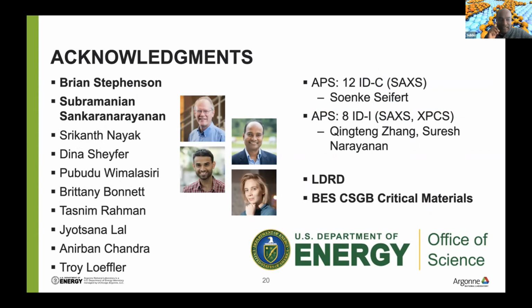So, Michael, I know you basically pointed to the modeling side where the AI/ML could actually be useful, but in terms of directly extracting information from the XPCS experiments, where do you see the scope for AI/ML, especially related to the critical phenomena, an area that many of the chemists are especially interested in?